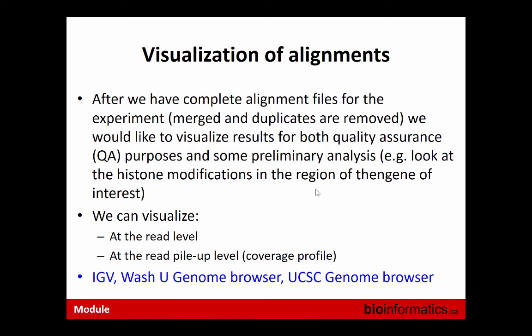Yes. So when you're merging your FASTQ from different lanes, is it better to merge the FASTQ or to merge the SAM? I think it's better to use FASTQs as they are and merge afterwards. Why? Your FASTQ is coming from slightly different experiments, from slightly different experimental conditions, maybe from a different sequencing machine. So you would like to align and then have your BAM file to maybe run stats on them and to see this FASTQ has 90% of alignment and this one is only 30. Then you would know that maybe the whole flow cell had some problems. So you always can merge afterwards.